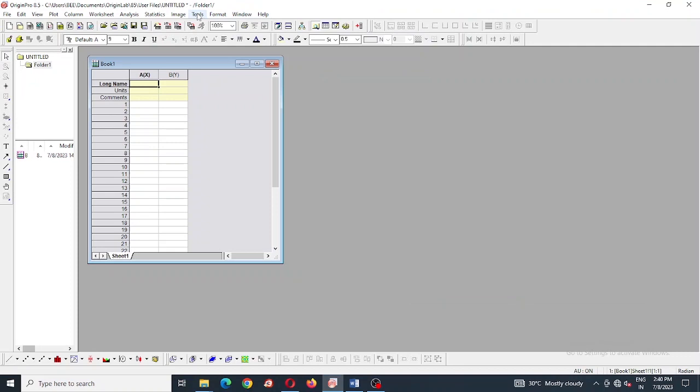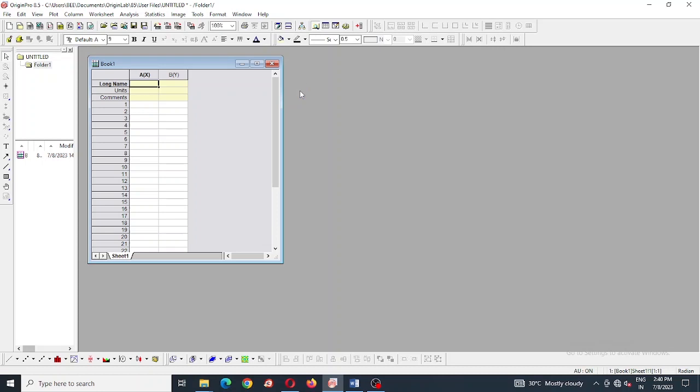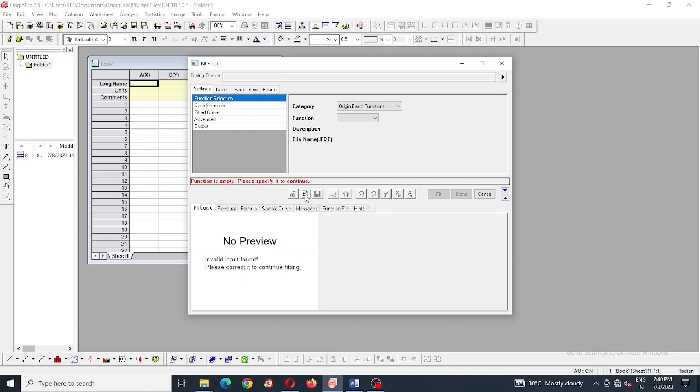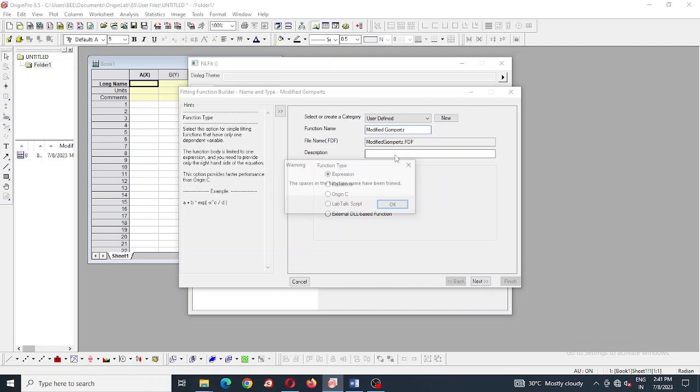First go to analysis, fitting, and nonlinear curve fit. After this we are going to create new fitting function and change the function name to modified Gompertz equation. Function type is expression, then we are going to click the next button.